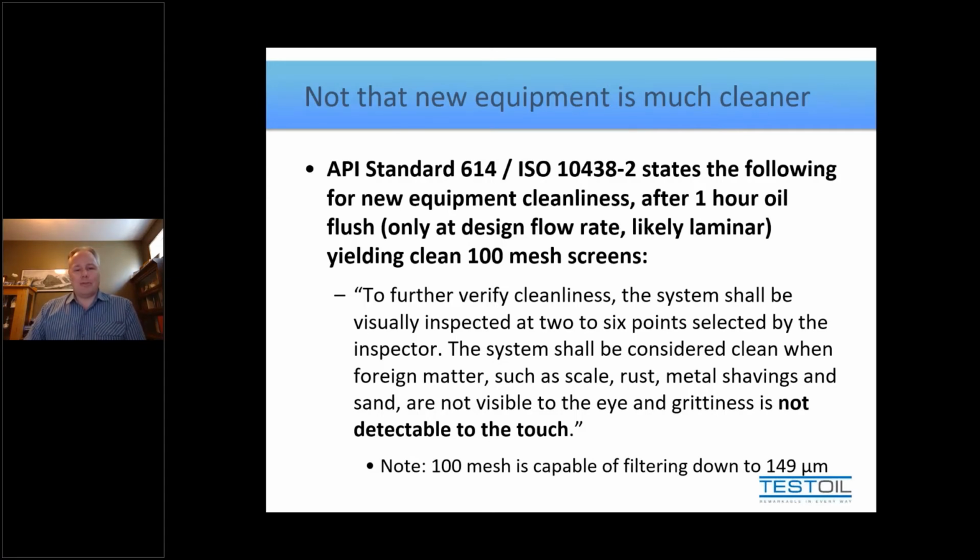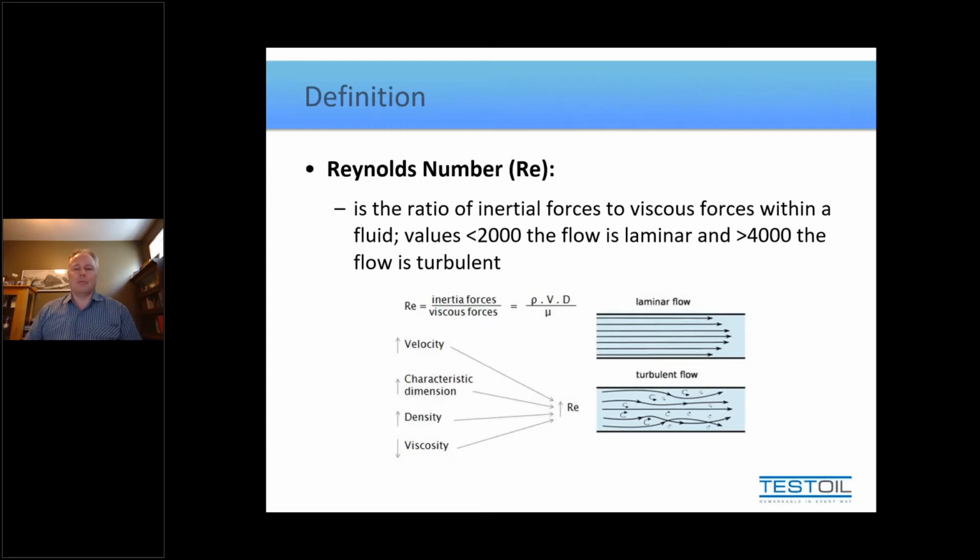Now, why I was harping on the flow rate, just to give those who don't know the terms a bit of an explanation here. When we describe flow, there's a certain equation that you can use called the Reynolds equation, and it takes into account certain factors which you can see listed here. But long story short, when you do the calculation, what you're trying to determine is the flow, what we consider to be laminar, meaning a very smooth stream, or turbulent, meaning, of course, that there's turbulence within the fluid. And the point of doing a flush is that you want turbulence.